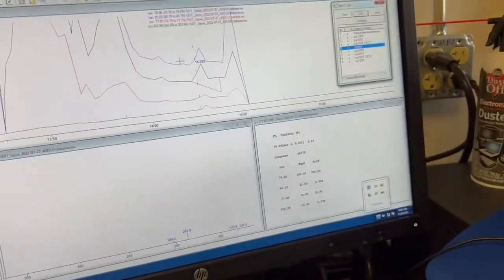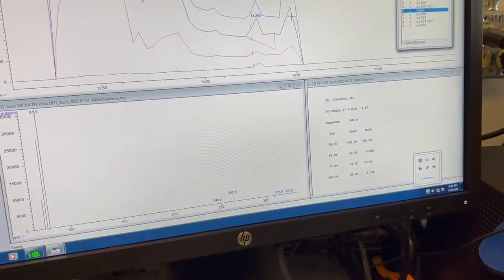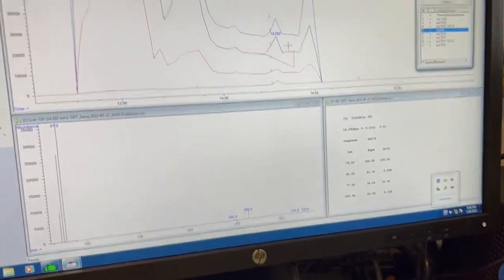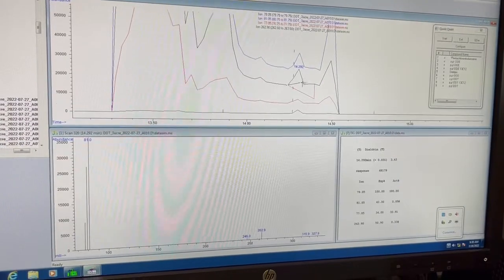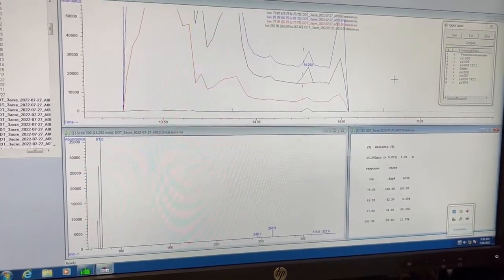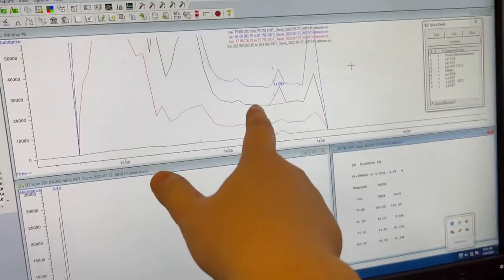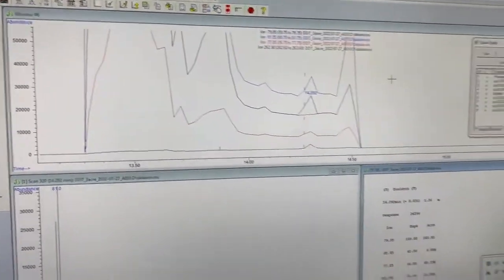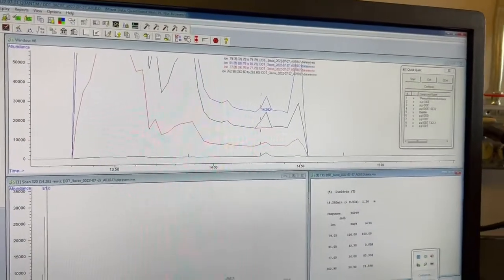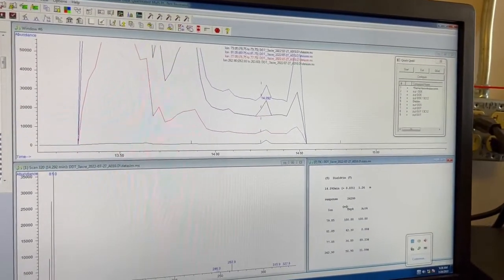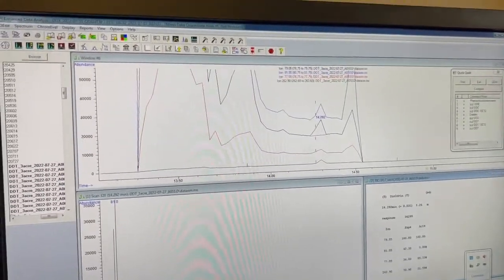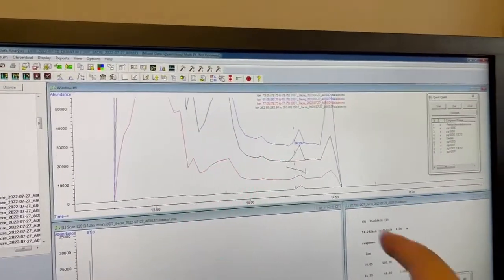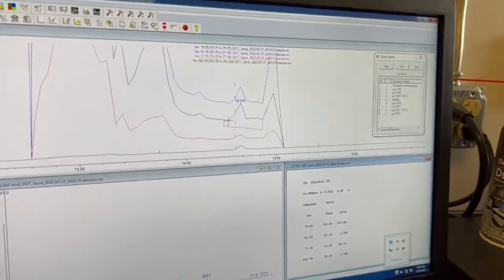I guess because it's considered the baseline drops to here. But it kind of looks flat on the other ones. I don't know. So I don't know. It's stupid sometimes. And so you just want to double check it or you want to fix it. It's just kind of gone like that. So they usually connect the left button and the right button. And you can see that our response here just changes dramatically when we did that. So this is very sensitive to selection of the baseline.